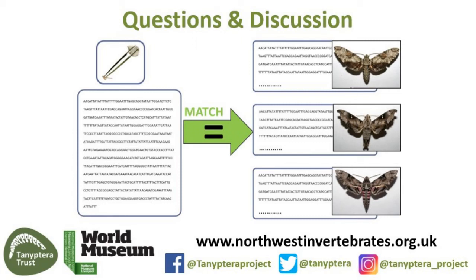Yeah. Okay, thank you. We have another question from Vieteki. Sorry if I'm pronouncing your name wrong there, but she says, in terms of storage of specimens samples to be used for barcoding, have you found any differences in using specimens in ethanol versus other preservatives in terms of the success of amplification?